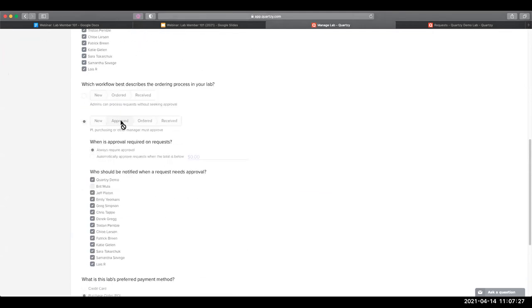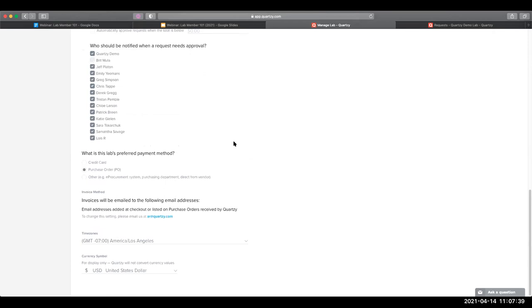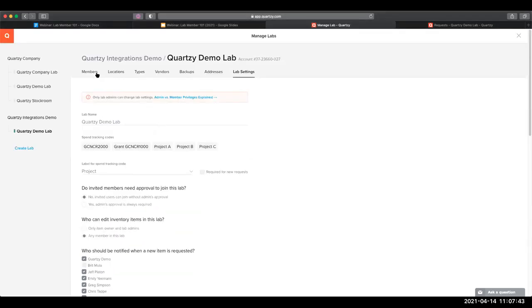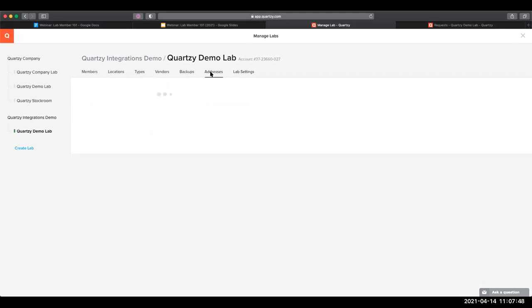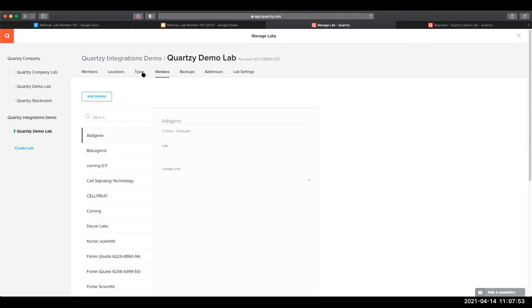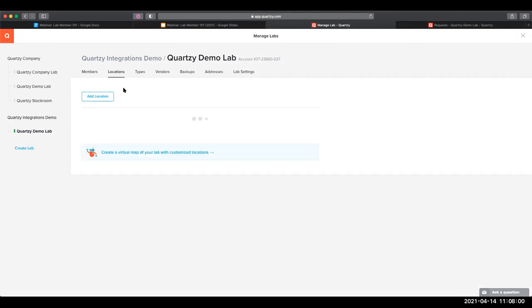This is where you can view basic settings such as inventory editing permissions and approval steps. In this lab, approval is required. If this was deselected, that would mean no approval from a lab admin would be required. Note that only lab admins are able to actually edit the settings on this page. For a member, it would be more of a view-only page. There are a few other tabs in this section which we'll go over later, such as addresses, backups, vendors where you can store contact information, and customization options for your lab's inventory types and locations tabs.